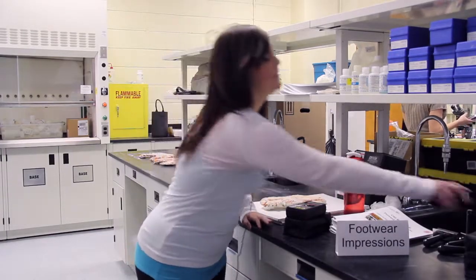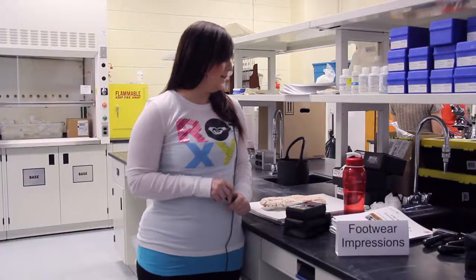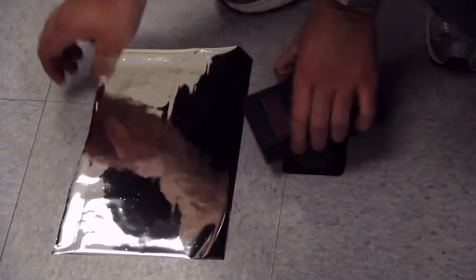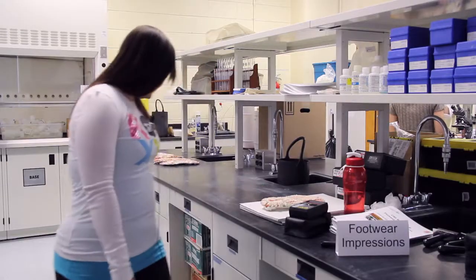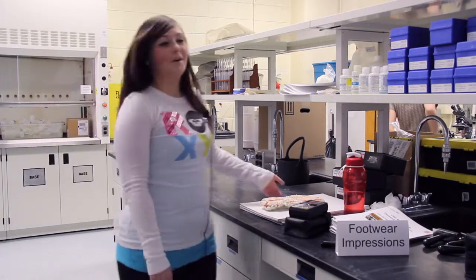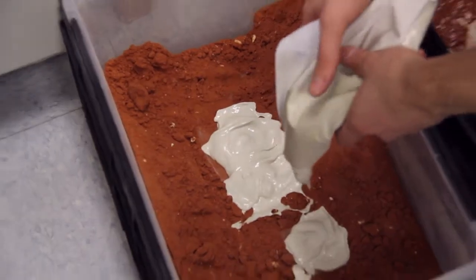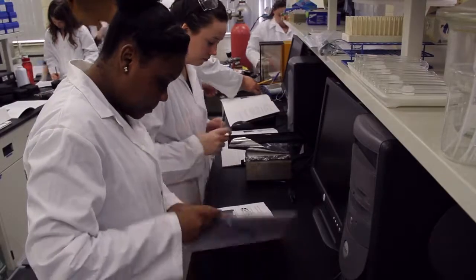At this station, students help themselves find their 2D footprint using oblique lighting against the floor, and then lift them using a mylar sheet and an electrostatic dust lifter, the Pathfinder. And after that, they then analyze the footprint and discover class and individual characteristics. Secondly, they use a 3D footwear impression created with dental stone and some sand, and they create their own footprint and again analyze their class characteristics and individual characteristics.